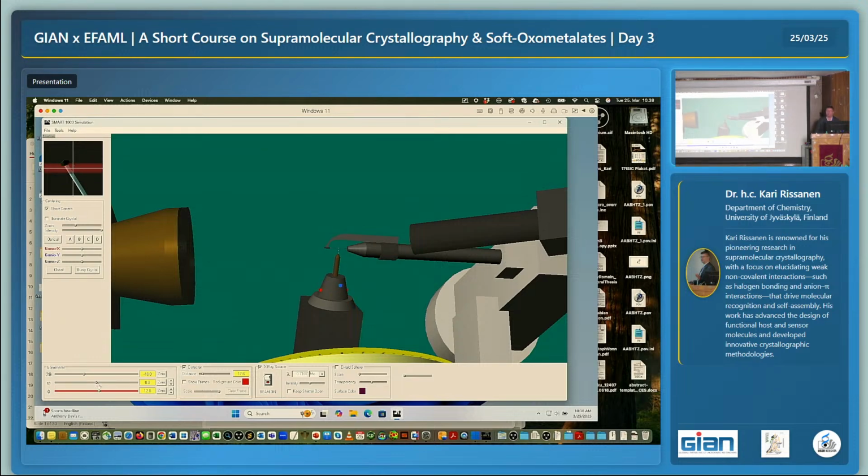And now the point for us is that in order to record all the reflections, all the information which is coming from these Miller index planes, we have to move the crystal. And that is done by this instrument. So the idea is, first what we have to do is to place the crystal, which is here now, exactly in the center. Because only in the center, remember the X-ray beam is something like 100 microns, 0.1, 0.2 millimeters in diameter. And the crystal is sitting inside here. Of course, the beam is beside it, so it has to be in the same beam.